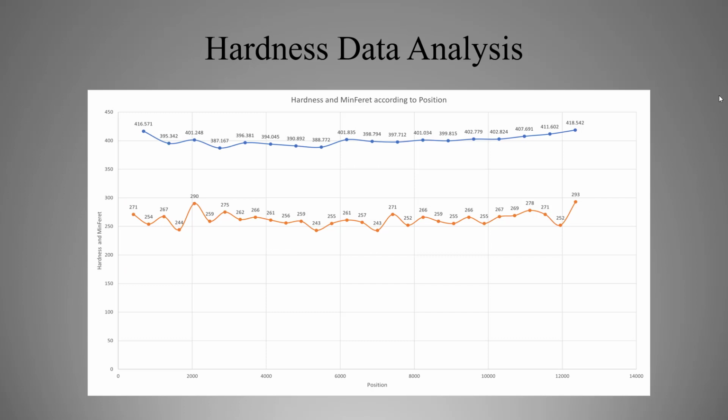I attempted to graph the hardness values and the thickness of the area of interest of the sample with respect to the global position of the images. Although it is not a clear-cut correlation, I did notice a similar trend in the two values. On the edges of the sample, where the coating is thicker, the hardness value is higher as compared to the mid portion, which is not as thickly cold sprayed.